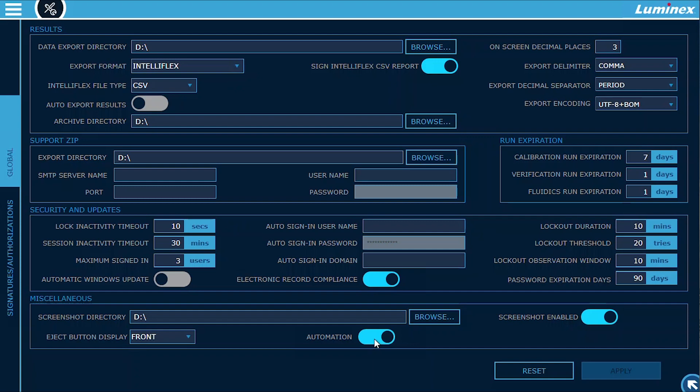This API allows the IntelliFlex instrument to be controlled by an external PC enabling integration with hardware such as liquid handlers, robotic arms or other laboratory automation components.